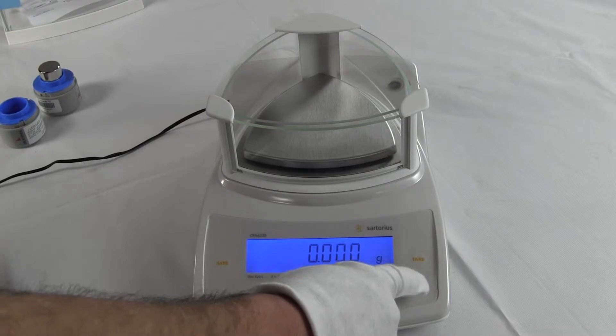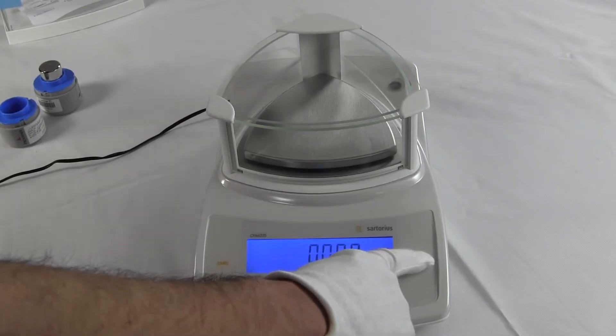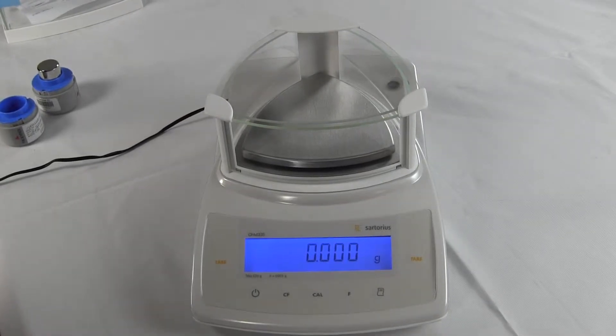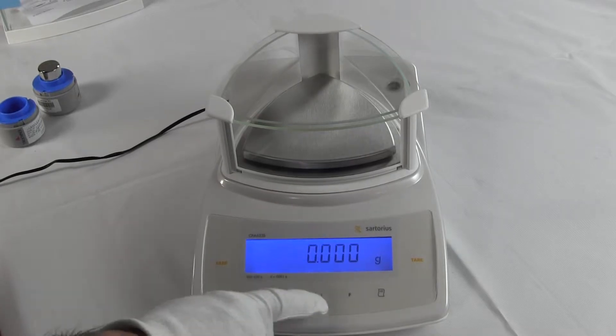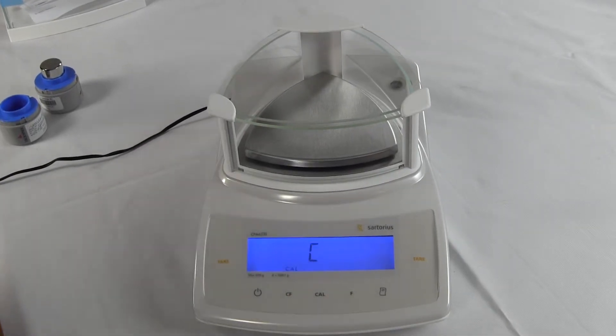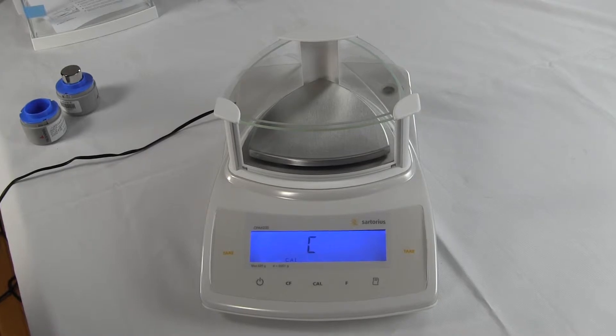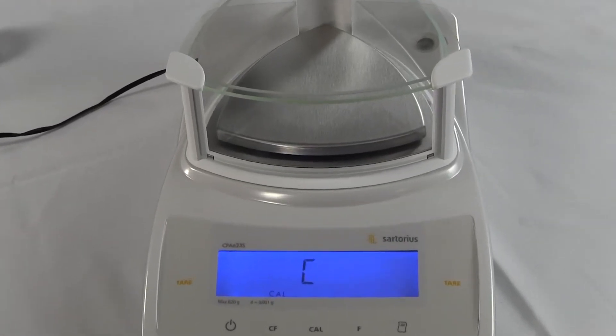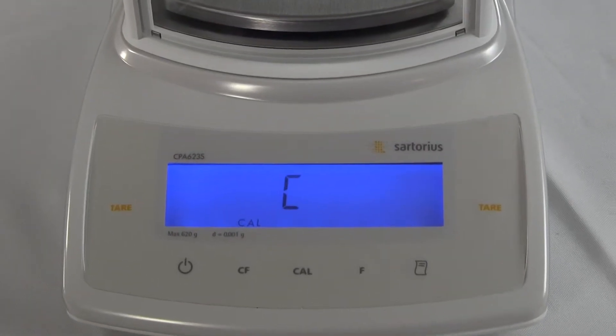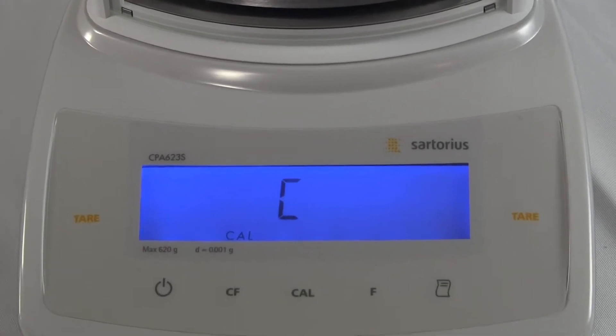I already leveled the balance. The spirit bubble in the rear. And so I'm going to press the tare button to tare out the balance. And to perform a calibration, one simply presses the CAL key. You'll notice the letter C. Then afterwards, it will say CC. And the calibration will be completed. It takes a few minutes.